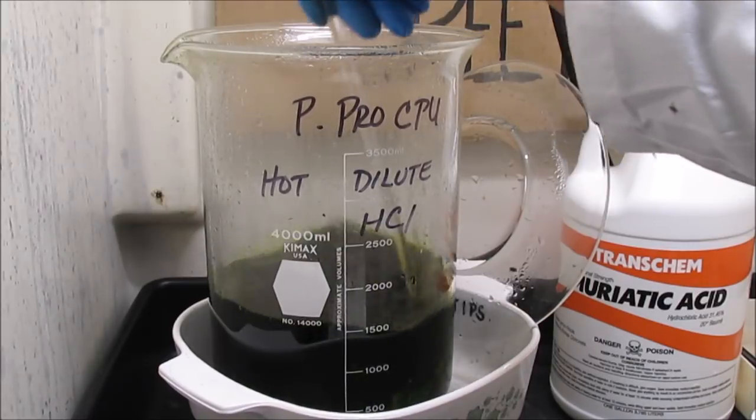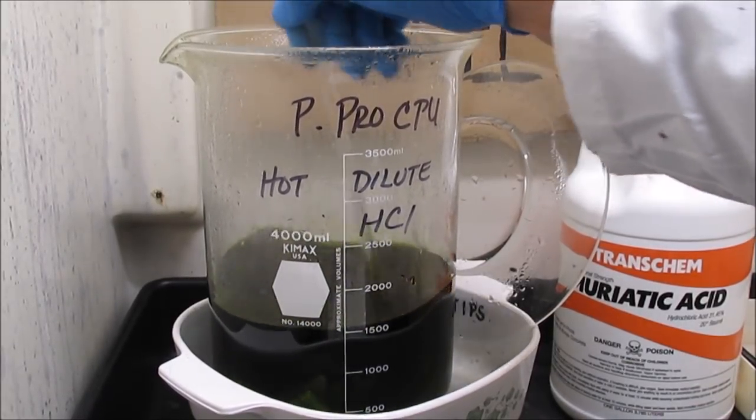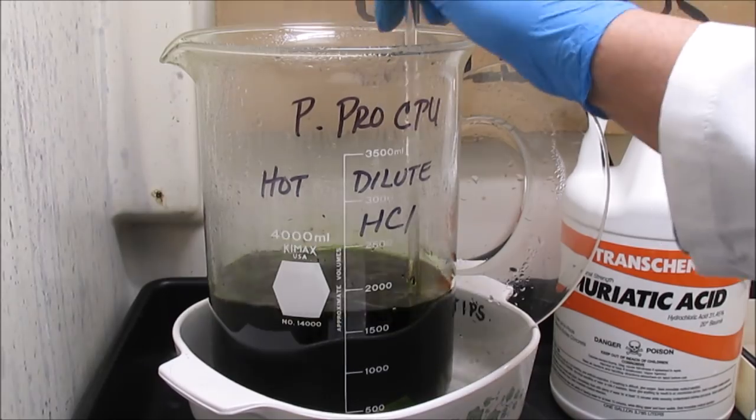The solution is a very dark olive green color looking. And I can see many of the small gold foils forming. Most of them are down at the bottom of the beaker.